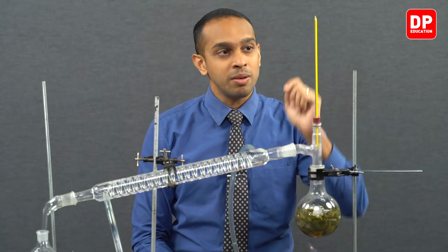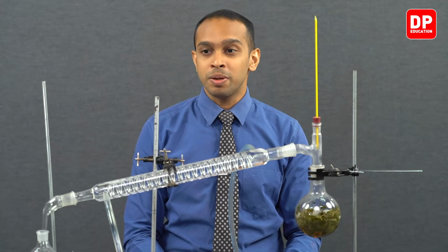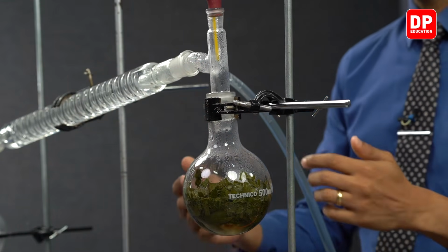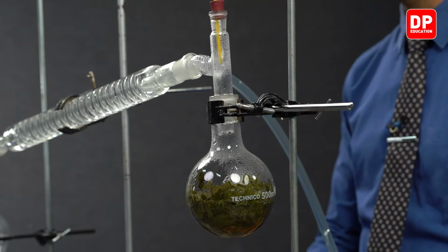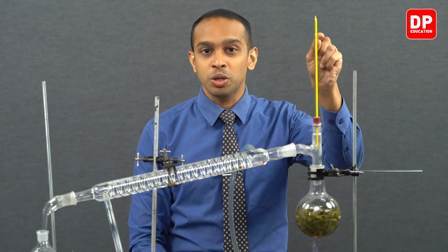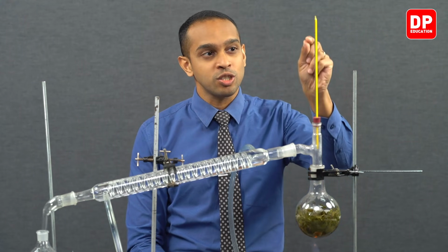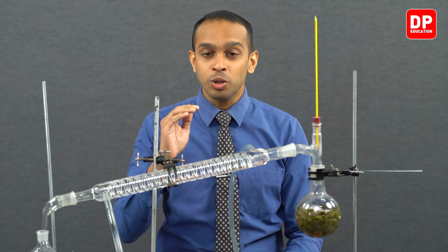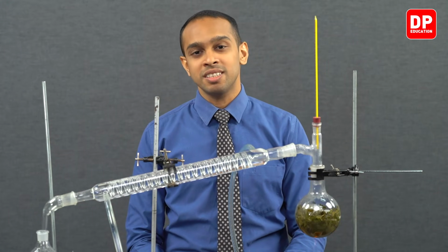So as I observe the temperature of this particular vapor that is produced here, we can actually measure the temperature of the vapor as we have placed this thermometer inside this three-way adapter. The temperature does not go above 99 degrees Celsius. The temperature has stopped exactly at 99 degrees Celsius. It does not go above 99 degrees Celsius or over 100 degrees Celsius.